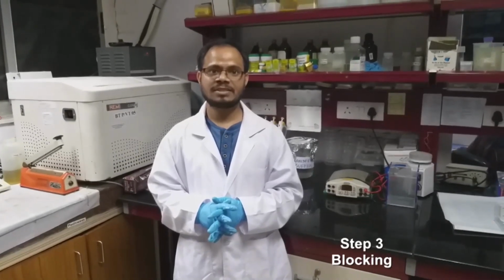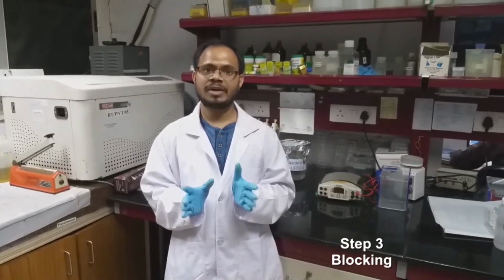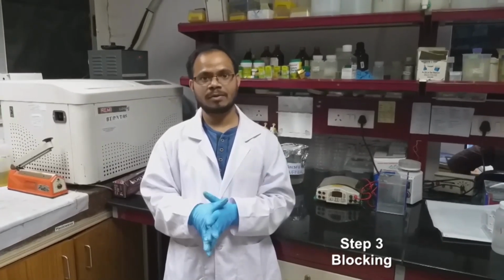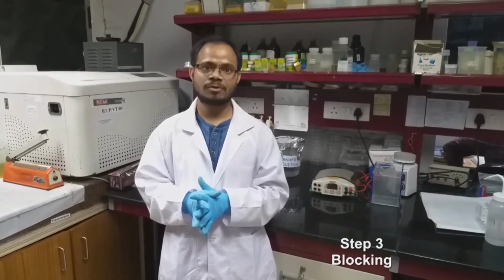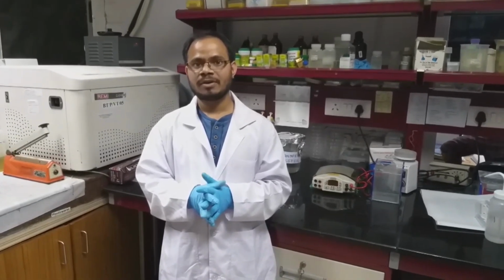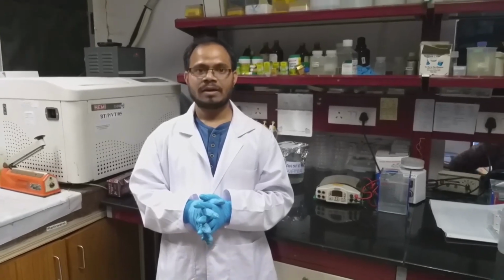The Western blot transfer all depends on the efficiency, how precisely you are doing the transfer. For example, you should not use your bare hands while handling the blot or gel. Whatever proteins are present on your fingers will transfer onto the gel or membrane, which will give high background during development of the blot. So always use gloves.